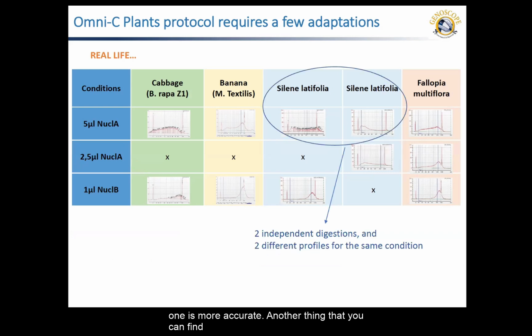Another thing that you can point out, sorry: for the same sample, we performed two independent digestions and we obtained two different profiles for the same condition. So it depends on the day, the climate, how lucky you are, but it's not perfect.